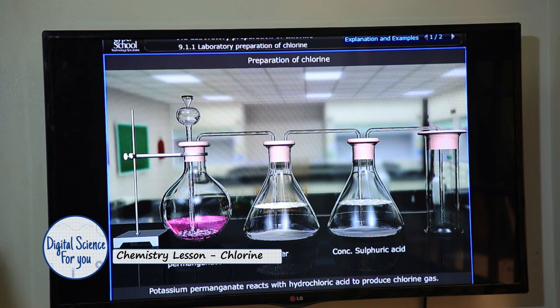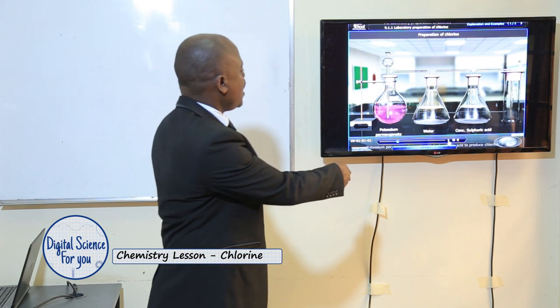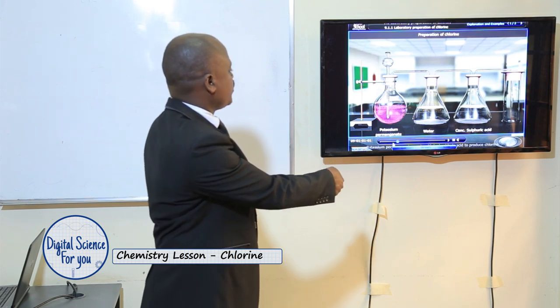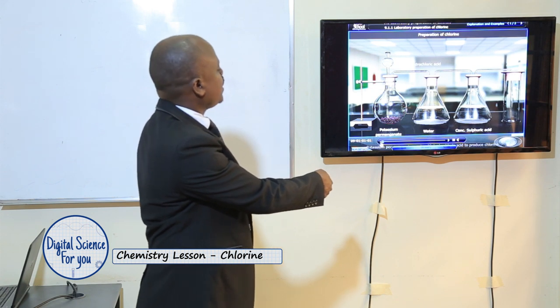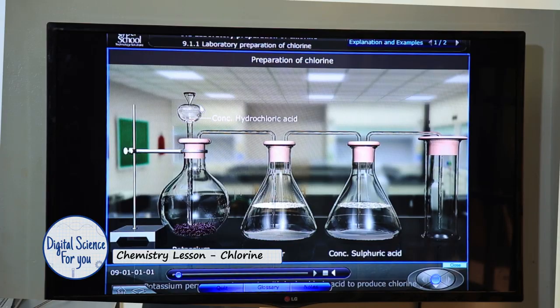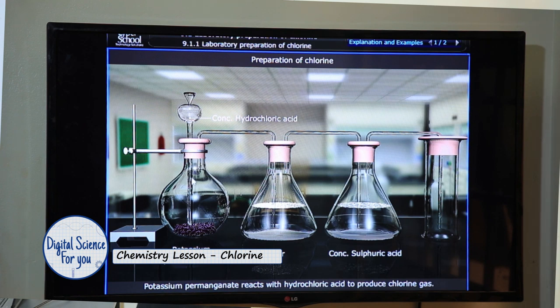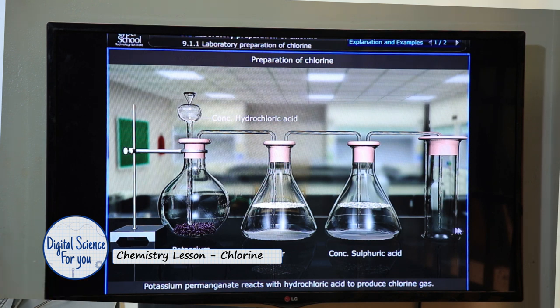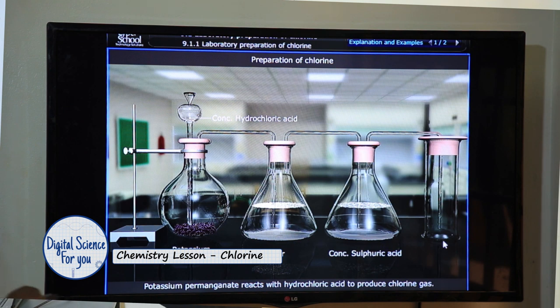This is the setup of the apparatus for preparation of chlorine. I am going to take it back to the beginning. We look at the reagents required. We have a Thistle tube in which we put concentrated hydrochloric acid. Then we also have potassium permanganate crystals, which we put in the round-bottom flask. We have two conical flasks — one with water and another with concentrated sulfuric acid. And then we also have a gas jar used for collecting the gas. All the flasks must be at the same level because they are on the table.